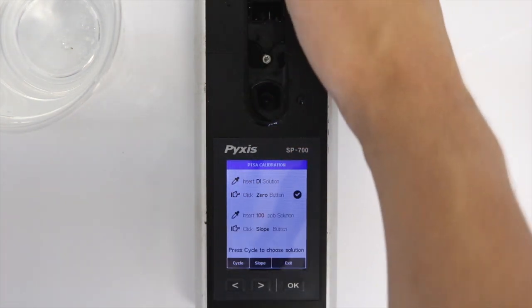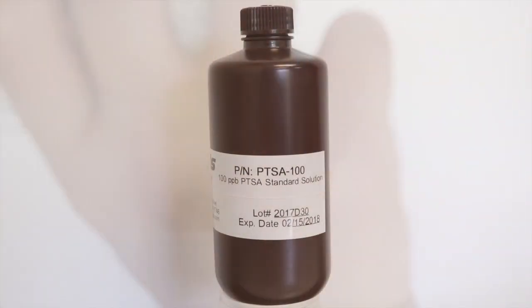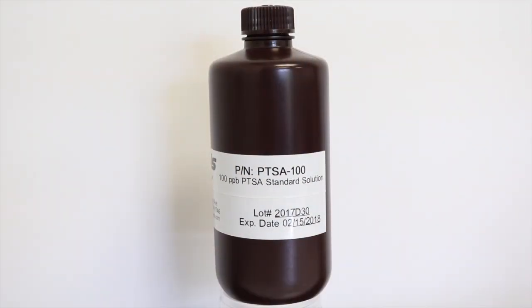Re-open the shield and remove the DI water. Then insert the Pyxis standard 100 ppb PTSA solution.